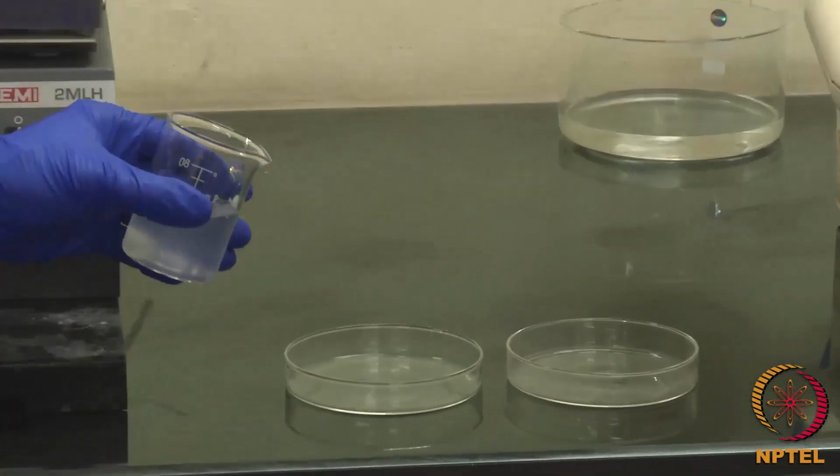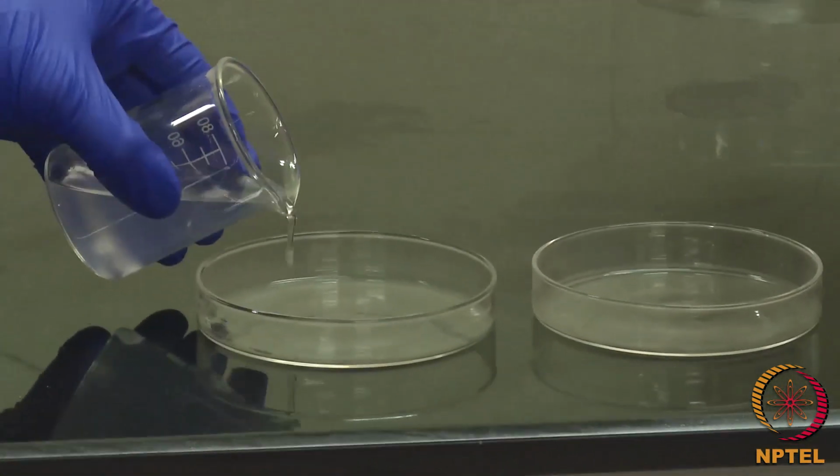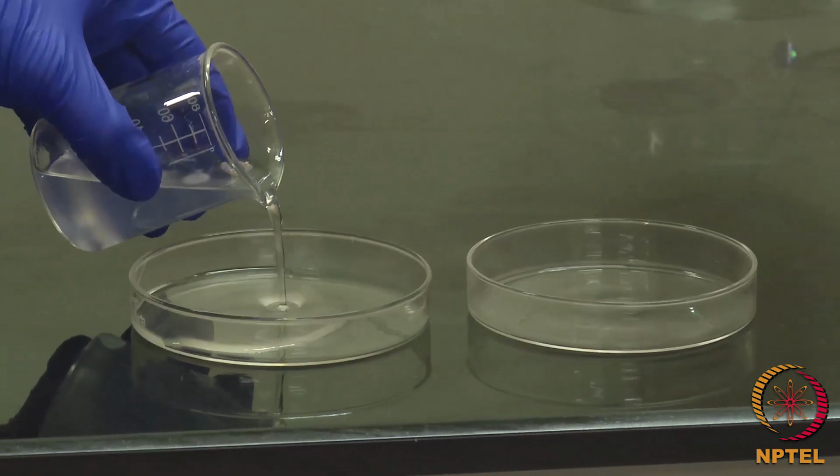The transparent solution is poured into a glass petri dish and kept undisturbed overnight to get the transdermal patch.